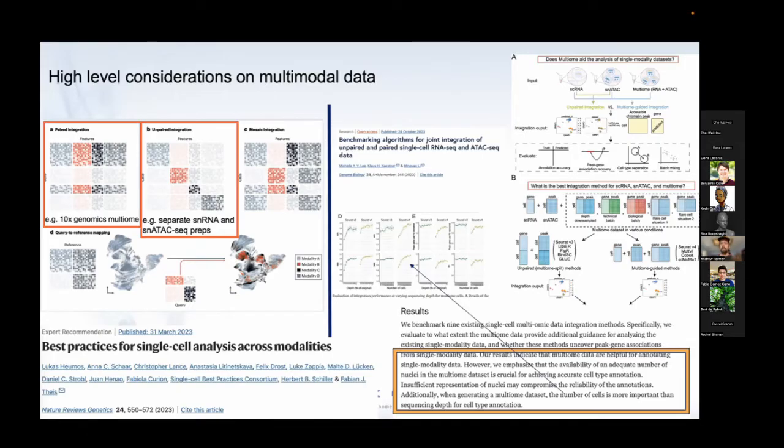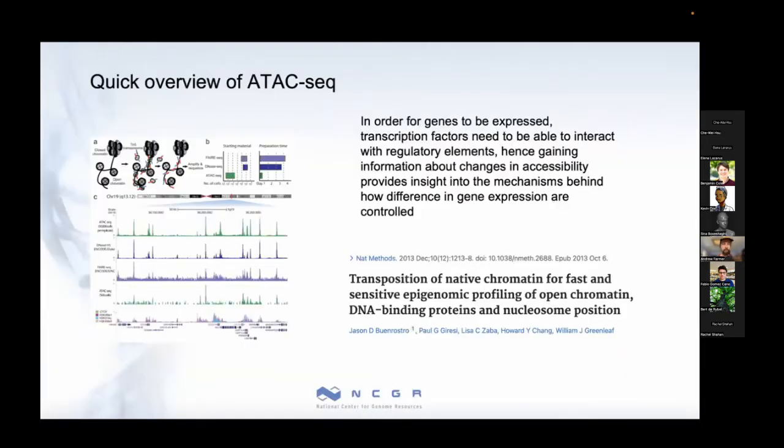And when you're talking about single-cell ATAC-seq data, you're really talking about single nucleus data. And this question about how do you tell good quality nuclei from bad quality nuclei, and how do you increase the numbers that you're working with for some of these things where you're really dealing with sparse data, seems to be a continuing theme from a lot of the speakers. So I'm happy to be able to maybe add a few perspectives to that.